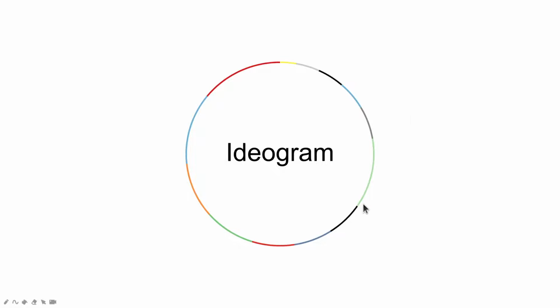Each of the chromosomes has a different color. For the color types, you decide what color to use to represent your chromosomes. You can also see that the chromosomes have different lengths, and those lengths are reflected in this image, but you can also do a reordering. There are things you can do, but for the most part, just displaying them like this will work fine for you. Those little details, I will explain when there's the need.